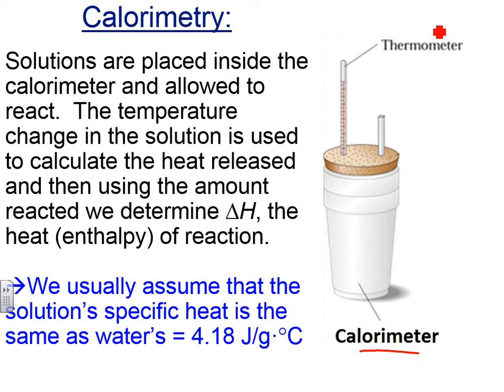In this case, this is a stirrer. So you can actually stir your reaction. It usually has a loop that looks like this, and they use it up and down. What you do is you don't swirl it, you go up and down. But you can take the whole thing and just swirl it as well, but that's what's usually done. So the stirrer can help as well, but the most important thing is you're going to measure the temperature, because you'll know how much is inside of here.